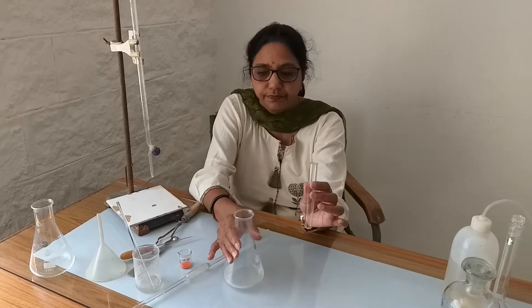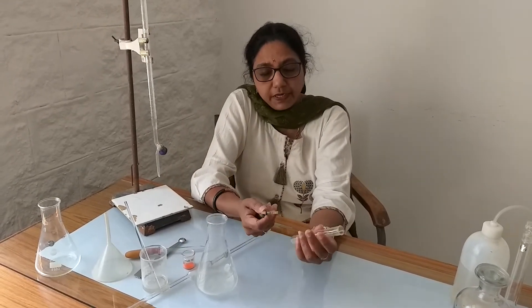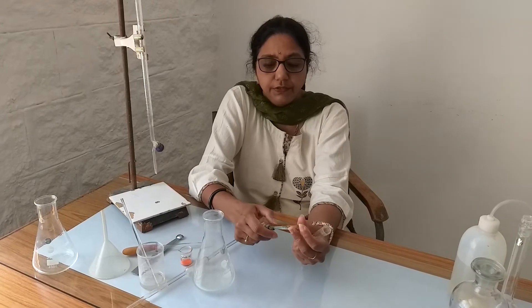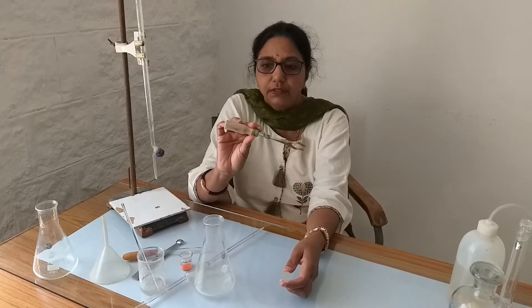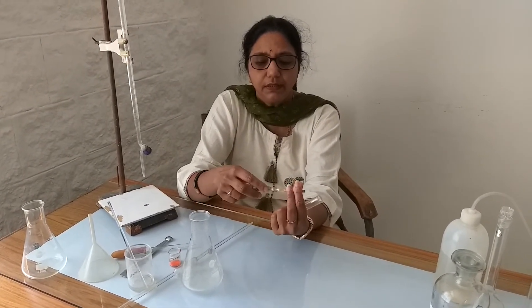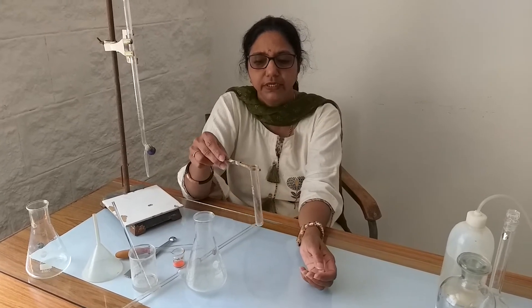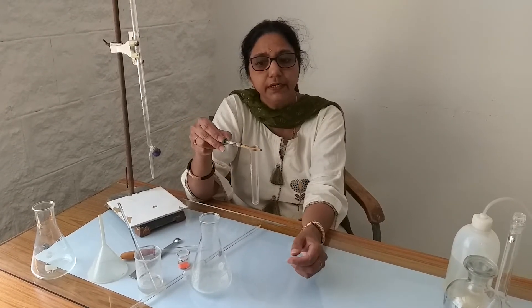This is a test tube. The test tube is used for various purposes. During salt analysis, the salt is taken in the test tube. With the help of this test tube holder, we put the test tube in the holder and lock it. So that when we are heating the test tube on the flame, our hands are away from the flame and will not get burnt.